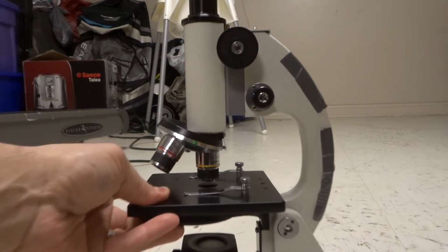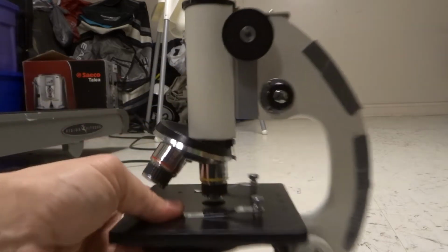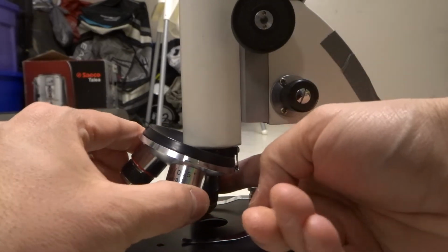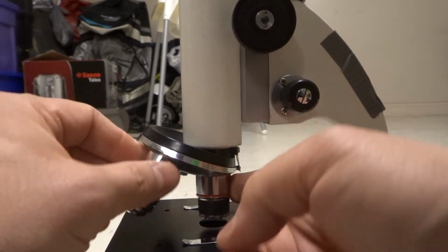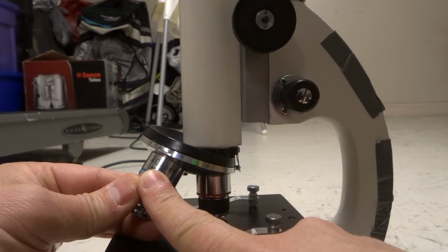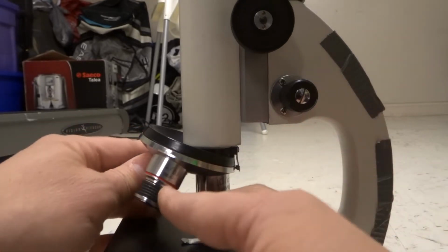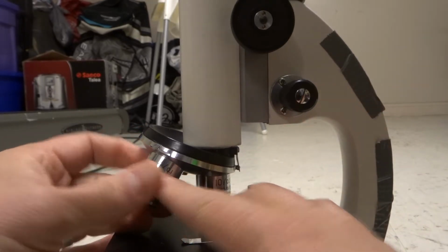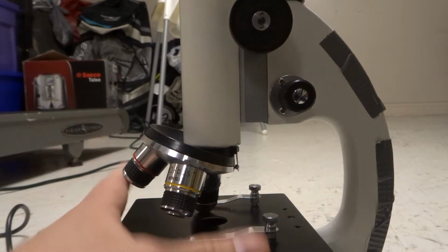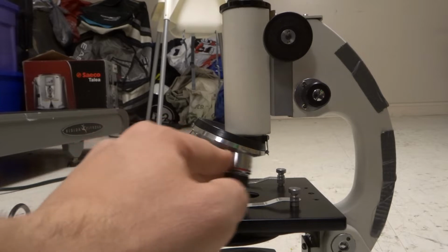The first one that's pretty much always going to be there is your objective lens. I'm going to bring this closer to the camera. You can see most microscopes have rotational objective lenses. So you can rotate this objective lens and it's going to offer you different levels of magnification. You can see this one is 40 times magnification. This one over here is 4 times magnification. And this one is 10 times magnification. So if that's the case and you only have an objective lens, then there's no need to calculate it.